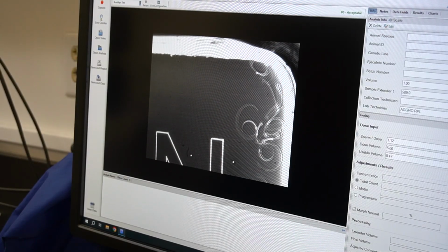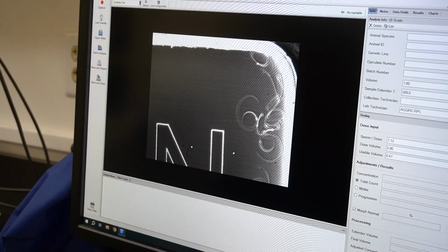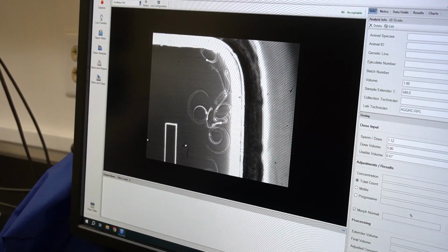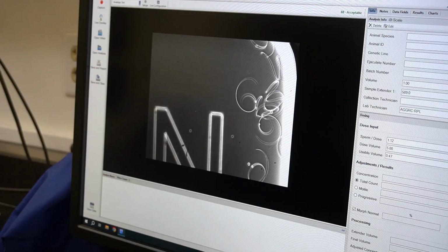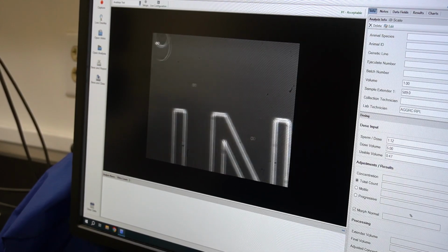And then you'll see me skipping these clusters of cells. Sometimes you'll be able to count how many, but because of the position and just how unfocused this is, which I can fix, it's just easier to either give your best assumption or, if it's a really big cluster, to just move on. So I can only really make out a couple, I'll say like 5.